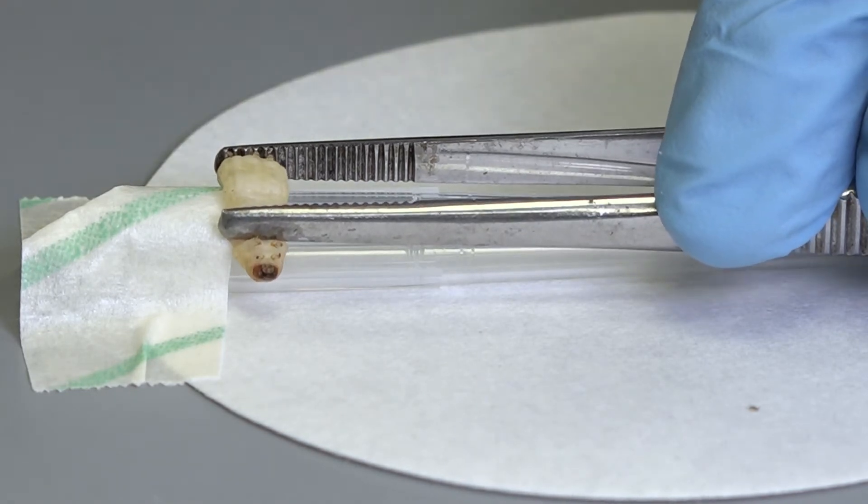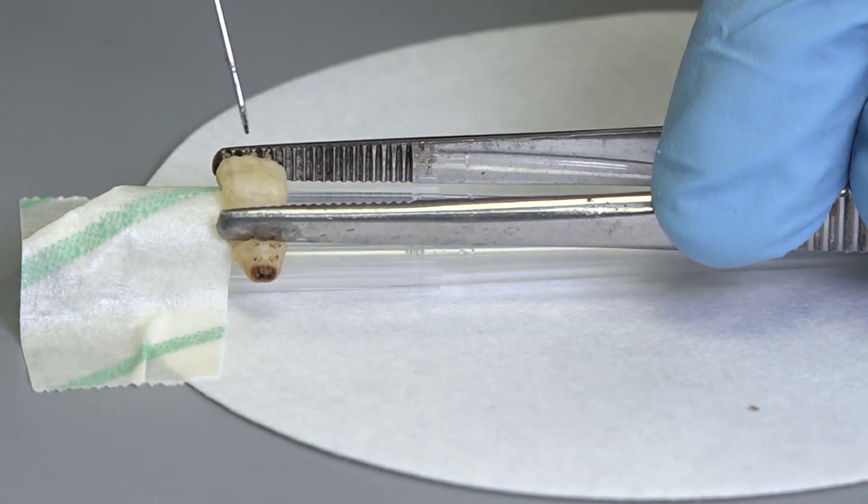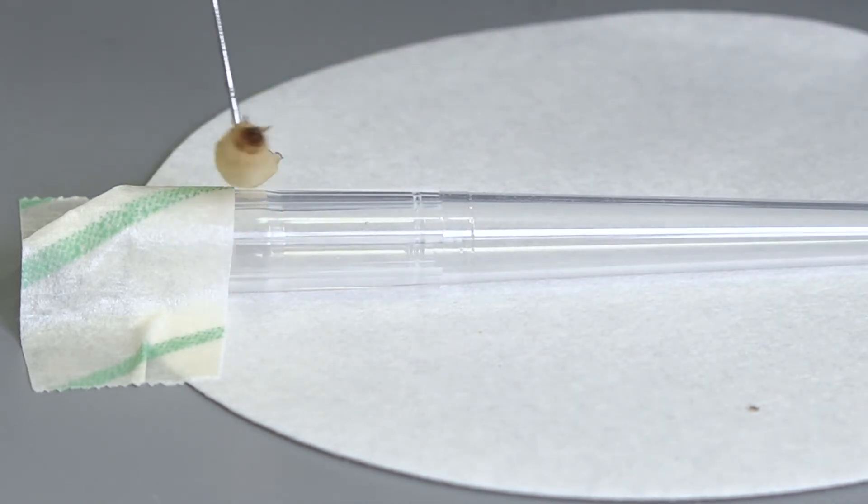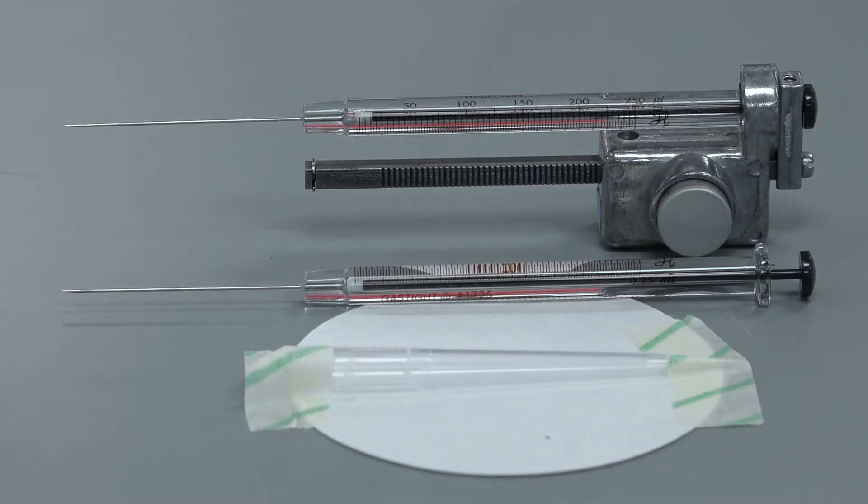Larvae are usually injected with a volume of 10 microlitres and we recommend using a Hamilton microsyringe to inject the larvae. An adapter may be used to automate multiple injection volumes. Using a 250 microlitre volume Hamilton microsyringe, a double click of the adapter will dispense 10 microlitres. Using this adapter we can inject 25 larvae with 10 microlitre doses within minutes.